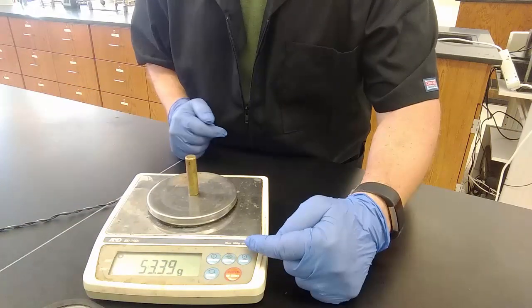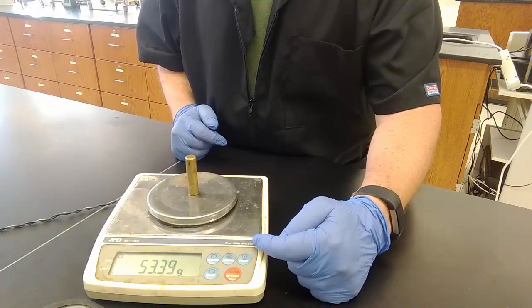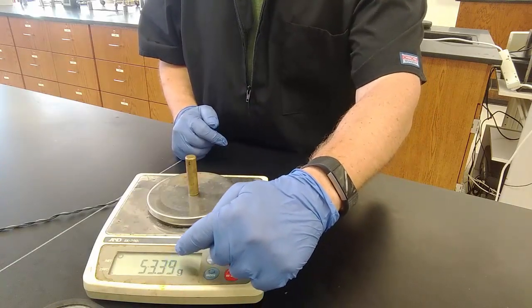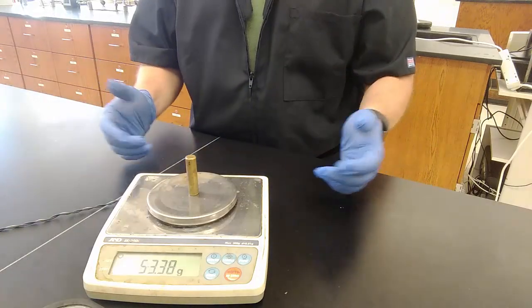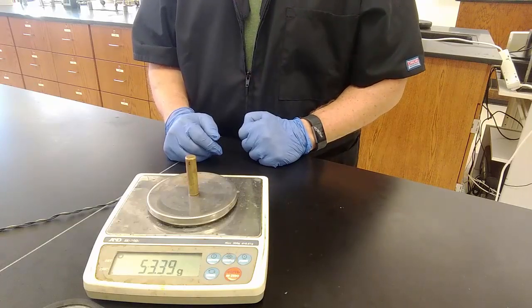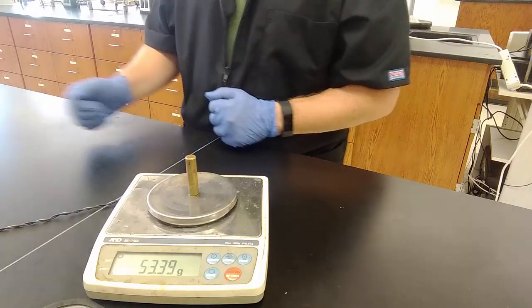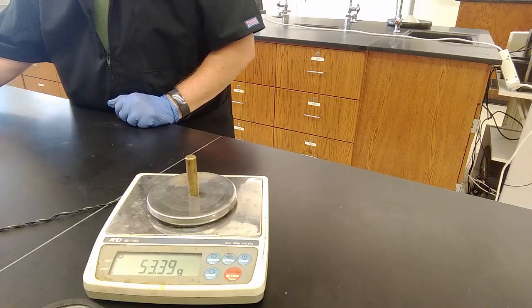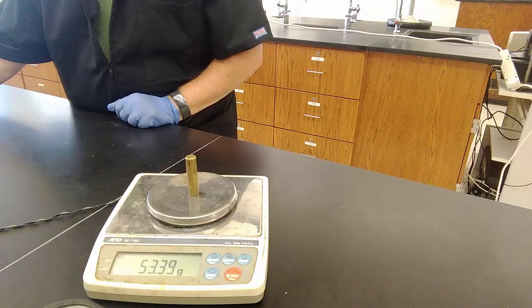It says right on here, maximum of 300 grams with a deviation of plus or minus 0.01. So this might be 38, it might be 40. The balance is guessing for us because it's digital. Were it an analog instrument like a ruler, you would be guessing the last number. You always have to guess one more digit than is available. This balance is doing it for us. So I would go to my data sheet and I would write down on line 1B, because 1A was the appearance of the stuff, I would write down the 53.39.